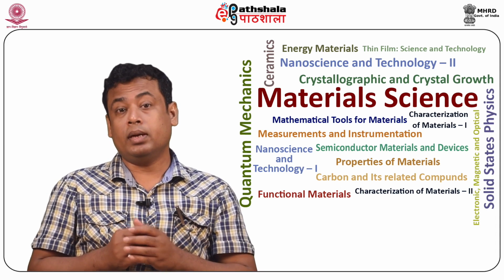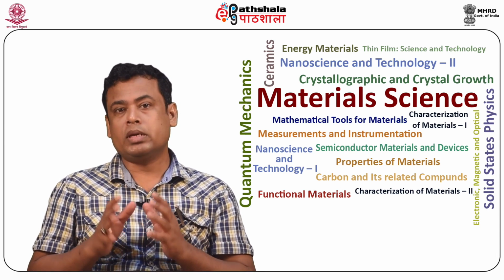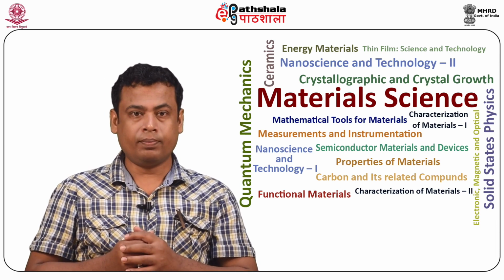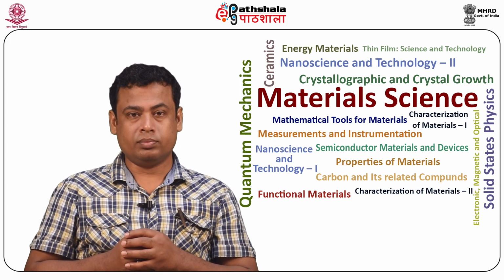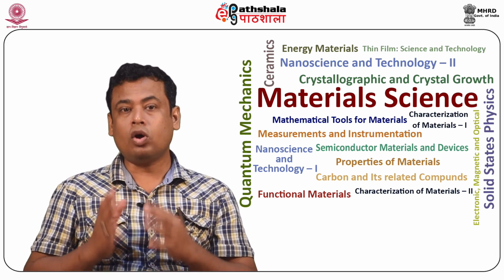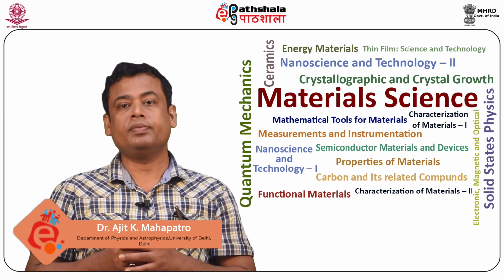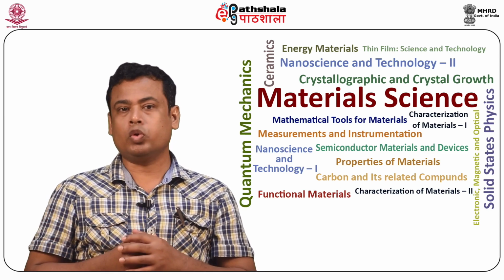So students, let us summarize what we have learned in this module. The AFM can generate an accurate topographic map of the surface features. There are three operational modes in AFM. First is contact AFM, second is intermittent contact or tapping mode, third is the non-contact AFM mode. Using the basic principles and different modes of operation, various kinds of force microscopes are developed. Thank you.